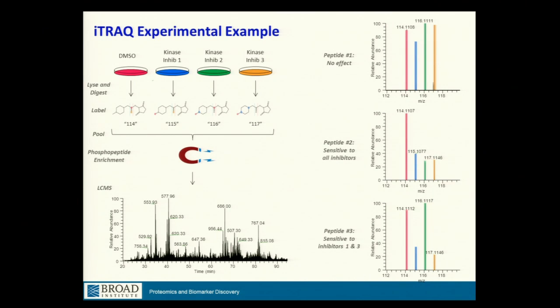But mostly the goal in phosphoproteomics experiments is to report the differential abundance of given phosphosites.